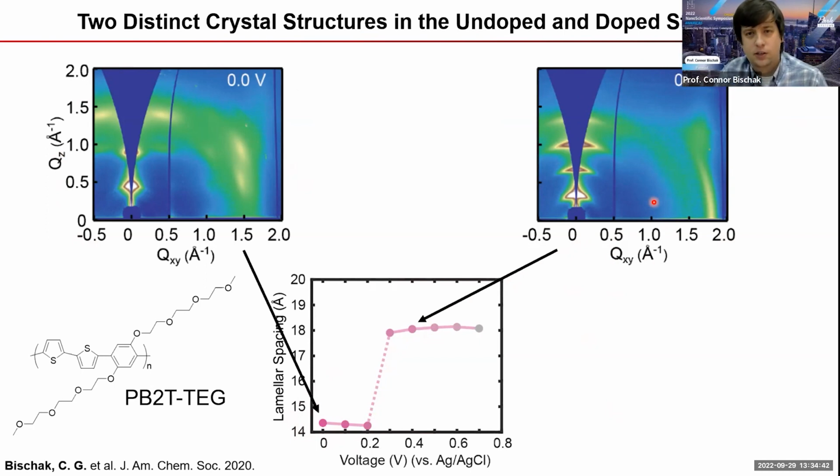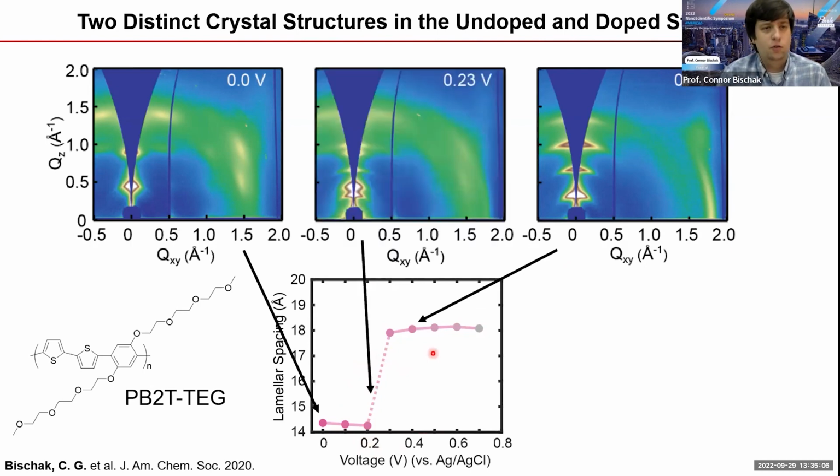The alternative is that there's something more analogous to a structural phase transition, where you actually see a discrete change in the structure of these polymers. And this usually happens in inorganic systems, like those found in lithium-ion batteries, where as you inject lithium, you see this kind of discrete structural change. So we looked inside this gap here, and what we essentially found was a phase coexistence.